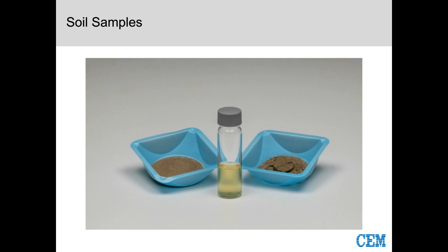I do want to note that for our soil sample, we used clean sandy loam from Sigma Aldrich, and we did note a few PFAS in the background of the soil itself. So we made a consideration of that for the data that I'm going to present here.